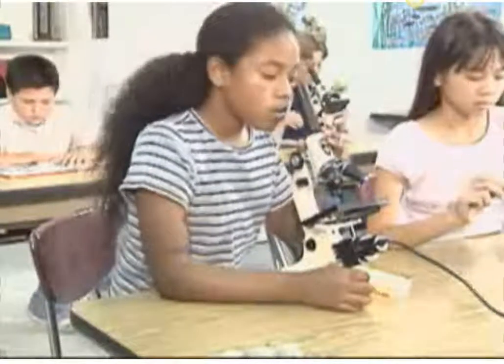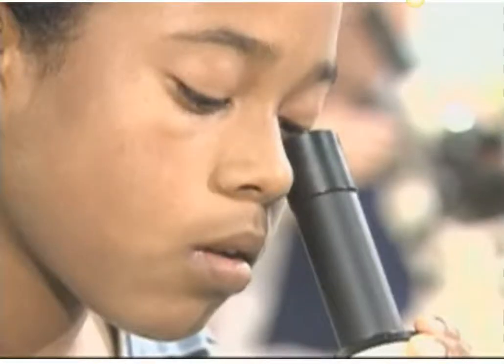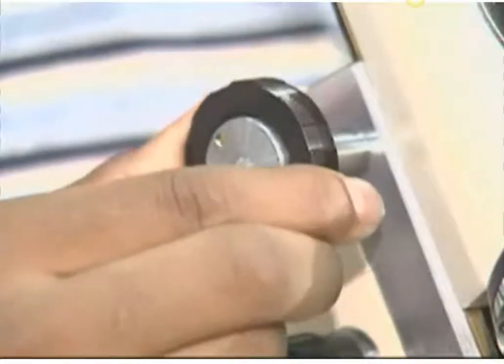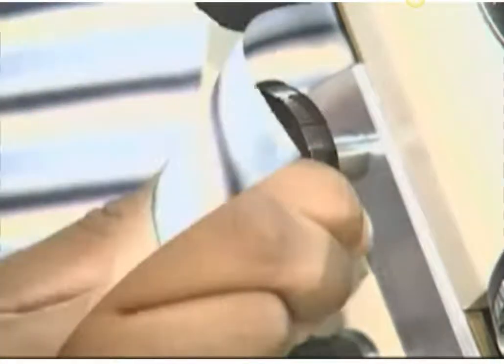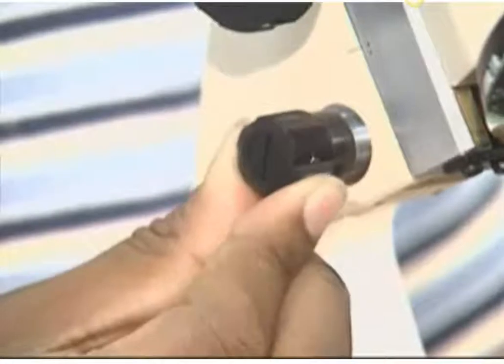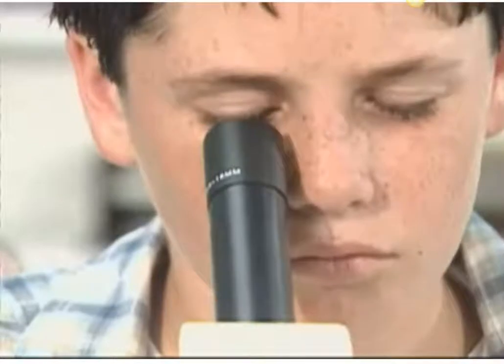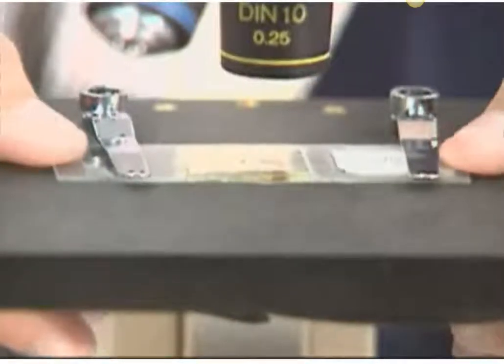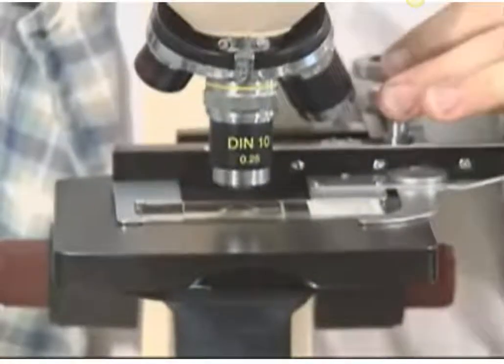Your eye should be placed directly above the eyepiece and a little away from it. You should keep both eyes open so they don't get tired. The large focus knob is used to bring a specimen into rough focus. The small focus knob is used to bring a specimen into fine focus. You may also have to recenter the specimen, which can be tricky because the specimen appears to move in the opposite direction you move it. Recentering is easy if your microscope has a mechanical stage.